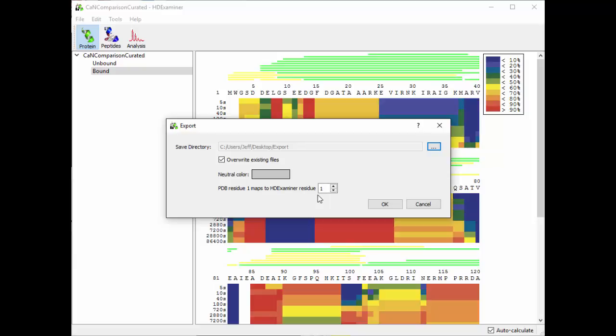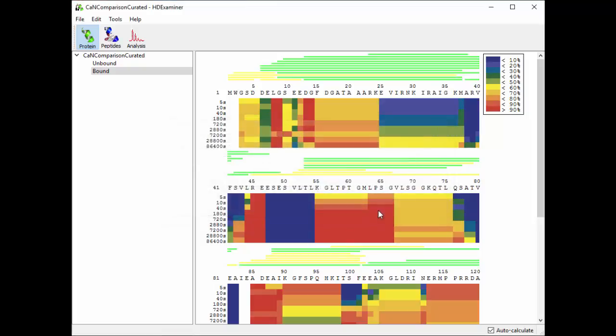If you're only using part of the protein in HD Examiner, then you would change this number to map PDB residue one to some HD Examiner residue. And bear in mind this number can actually go negative or positive. Okay, so the default is one and that's what I'm going to do here. So we hit OK.